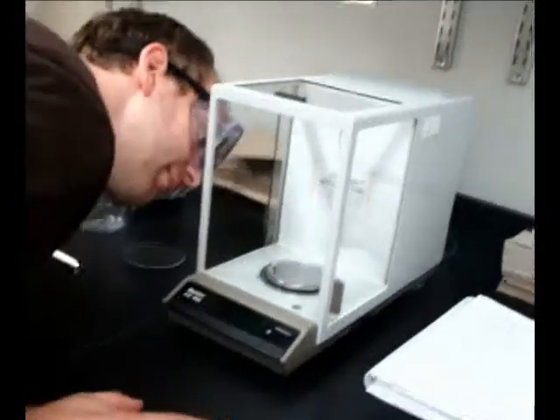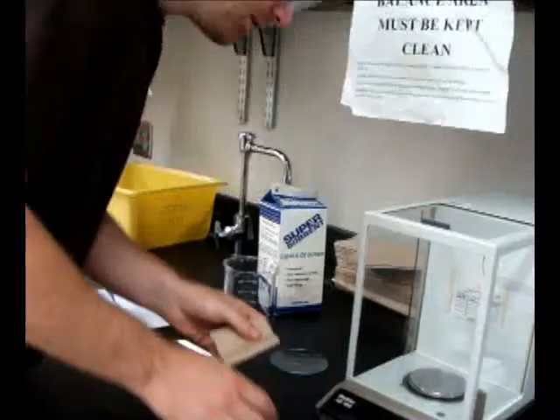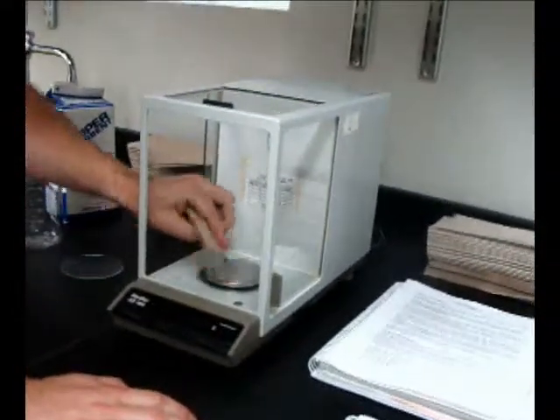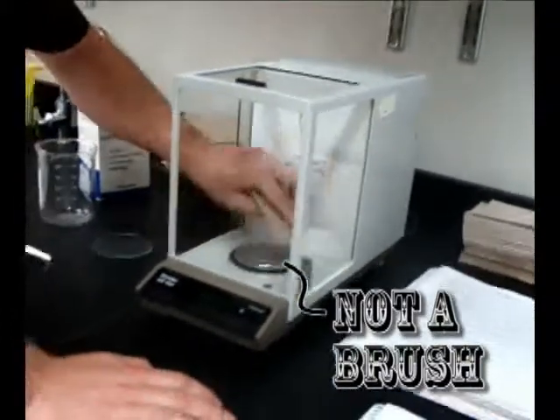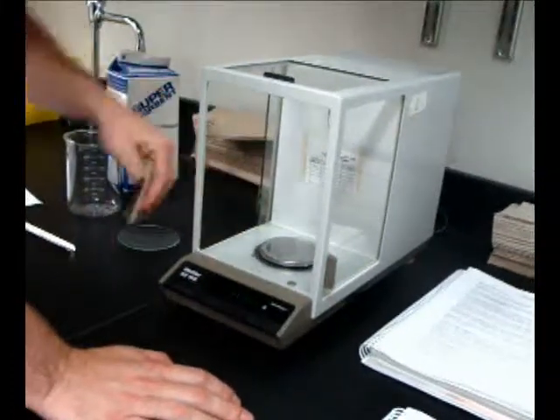Before using the analytical balance, inspect the pan to ensure it's clean. If not, use a brush or chem wipe to clean any dry debris, or a sponge to clean any wet debris, following proper waste disposal and handling instructions outlined by your TA.